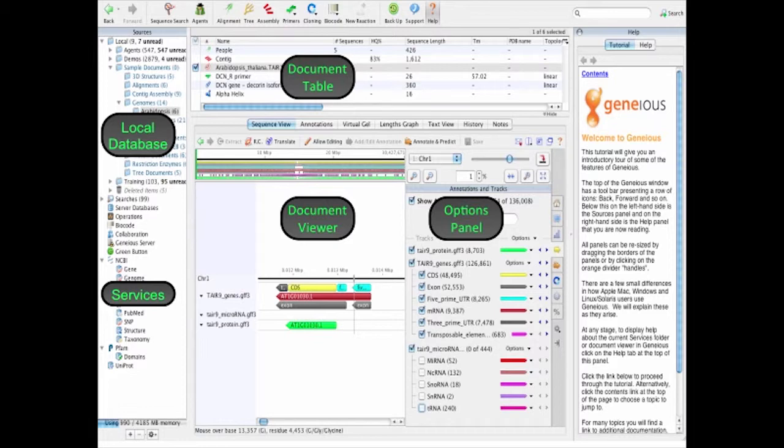There are multiple different views other than the sequence view available depending on the document type. The far right-hand side panel is the Help and Tutorial panel, which is effective for self-learning or for group teaching. Importantly, the tutorials were all designed by collaboration with academic partners and use real data from actual scientific questions that biologists address. The main functions are available in the menu bar, and this bar is also customizable to the operations that you use most regularly.